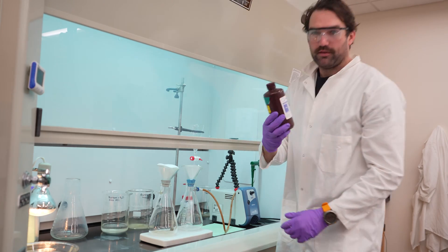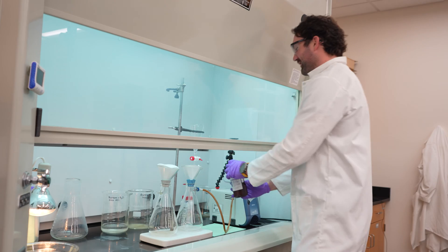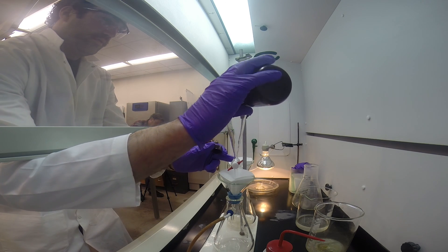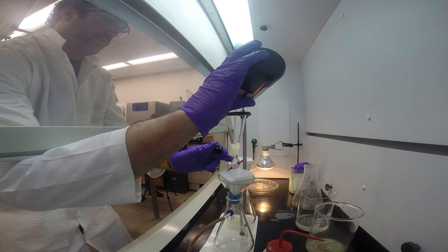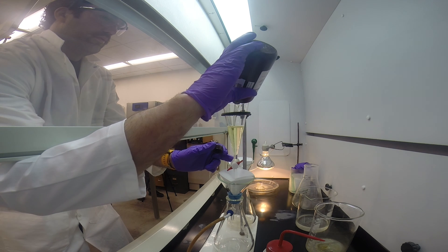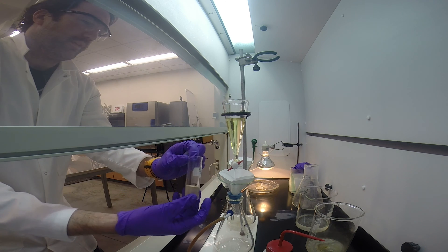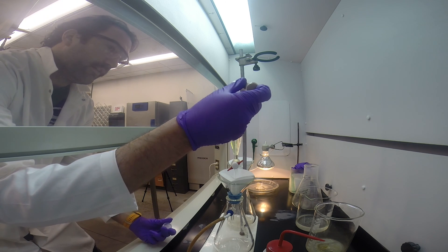To continue our quest, we turn to what is called heavy liquids. In particular, methylene iodide has a density that is greater than most of the grains left in our dwindling sample, but less than the mighty zircons. So zircons separate and sink to the bottom, and with careful procedures, we collect them.